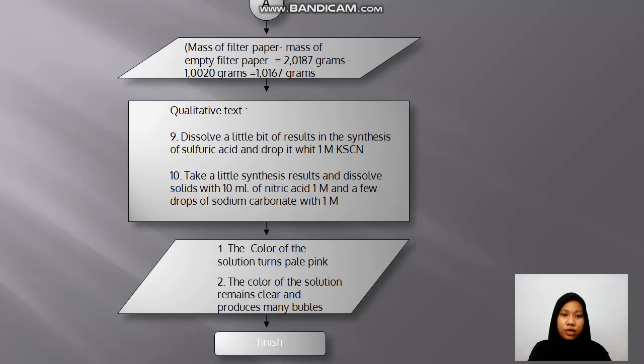Next, qualitative test. Dissolve a little of the synthesis result in sulfuric acid and drop it with 1 M KSCN.